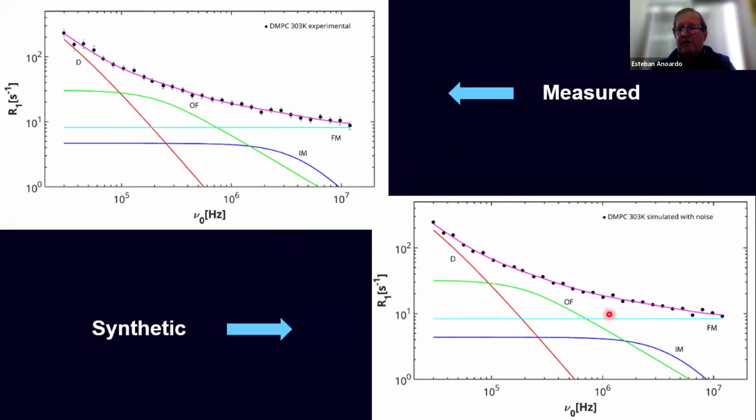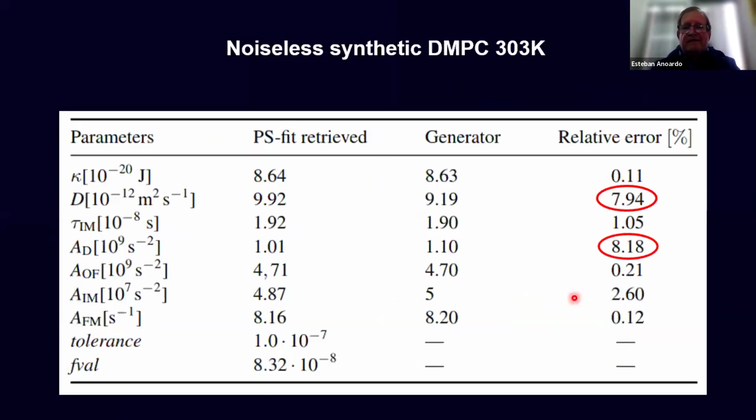And then we can produce many synthetic curves to analyze how the fitting engine is working. So this was a very important point in this work, to allow us to produce a large quantity of synthetic curves from different samples and to test the fitting engine. Okay, not everything is perfect.